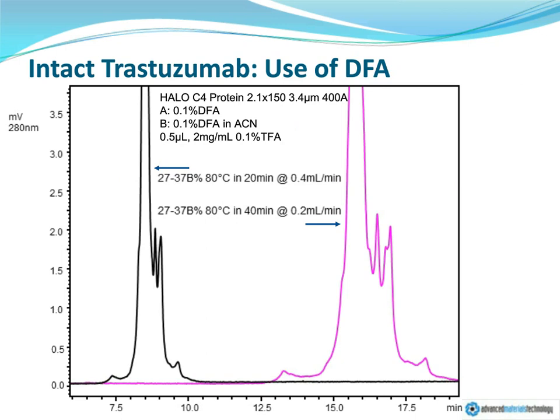One of the systems that we've looked at in considerably more detail now is using difluoroacetic acid.